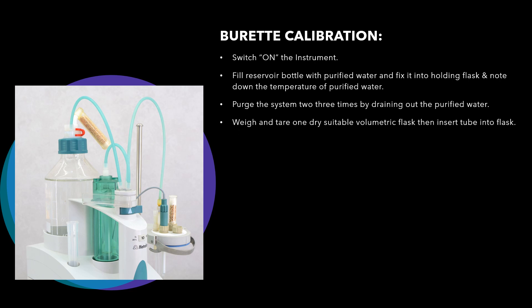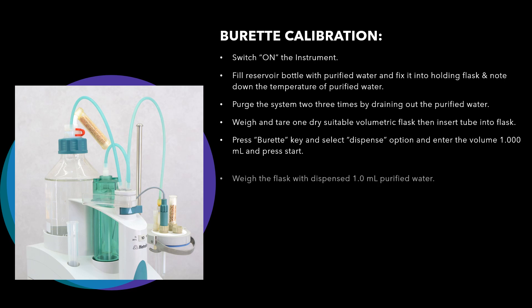Now take one volumetric flask, weigh it, and tare it. After taring, insert the tube from the reservoir bottle into this volumetric flask. Then press the burette key button, select the dispense option, and enter the volume 1.000 ml.